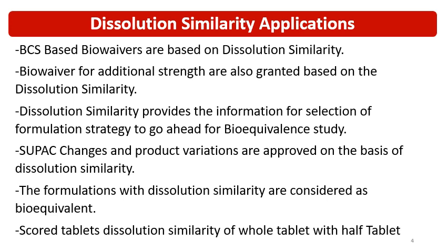Then, if you are using score tablets, or tablets with a break line, dissolution similarity is required between the whole tablet and the half portion of the tablet. So these are some of the dissolution similarity applications.